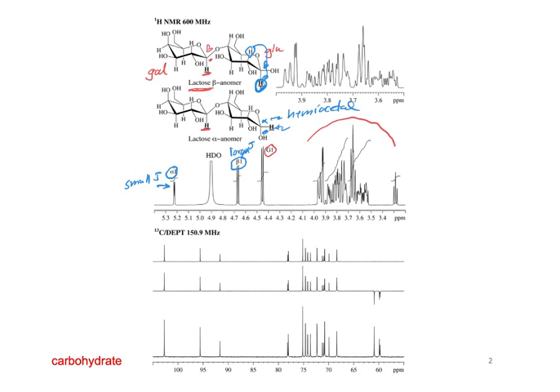We can also see the 3 anomeric positions here. And I think it's probably these 2, which is the ratio. It's like a 2-to-1 ratio of beta to alpha. And some of these other ones we can see split too, like there, probably there. We can see that these are the mixtures.